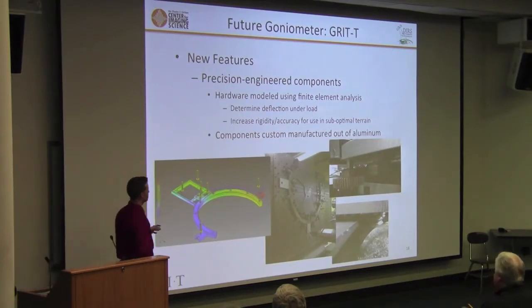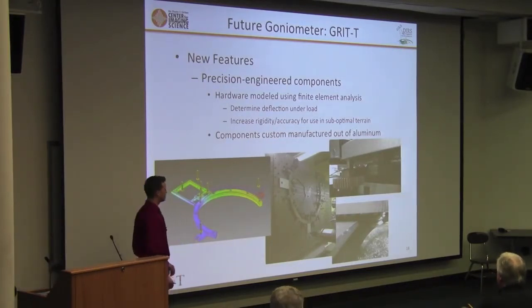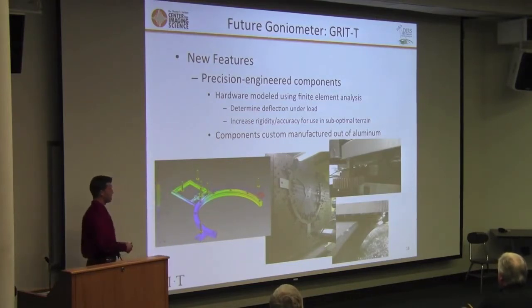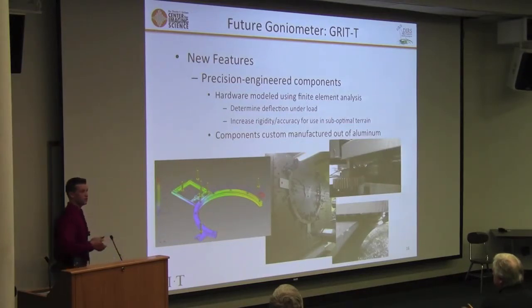And from this, we were able to design our own frame that was made here in Rochester at a company called Trident Precision, which does a lot of precision optical designs. So even though this ring is approximately 1 meter across, its concentricity is down to 200 micron, which means we have excellent pointing capabilities versus other goniometers.